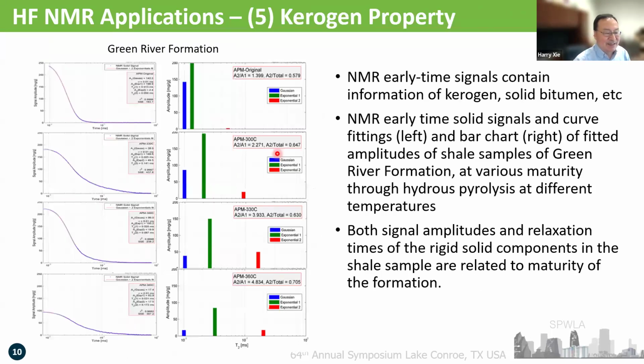Another application is combined NMR work. This is more advanced NMR work. Instead of using so-called T2 measurements, the CPMG technique, we directly use the so-called early time acquisition, which people sometimes call FID, free induction decay, or use the solid echo method to acquire the very early time signal.